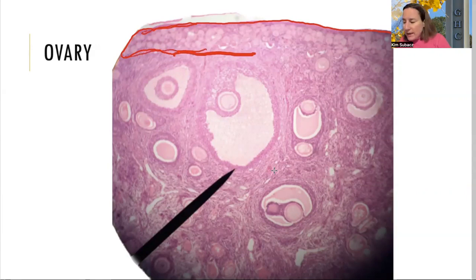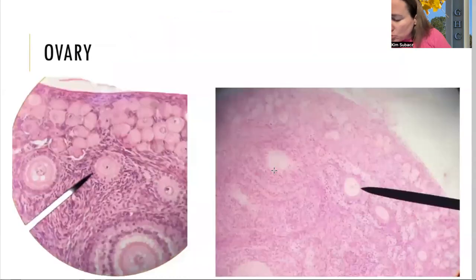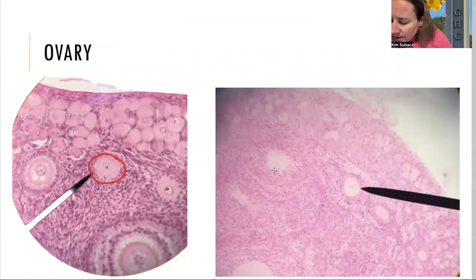And then we are going to have primaries. Let's see if we can find a primary. Where's a primary for us? This one kind of looks like a primary, maybe, sort of. Maybe an advanced primary. Let's see if we can find another one. Ooh, that's a good one. Here's one, maybe an example of a good primary.